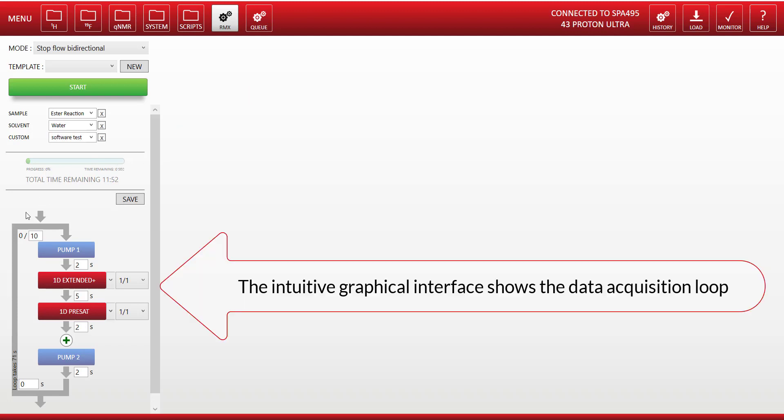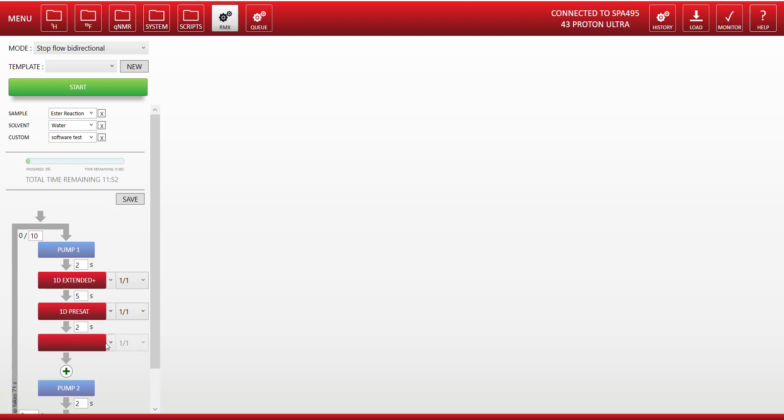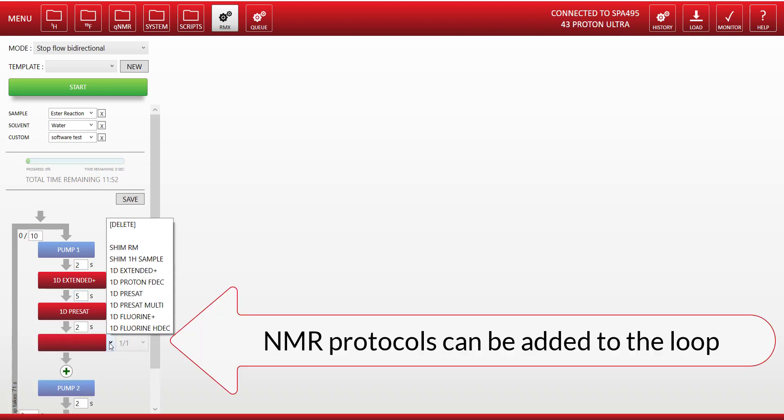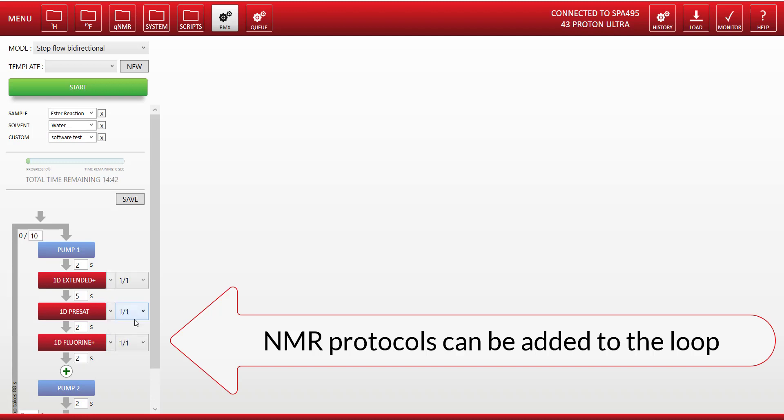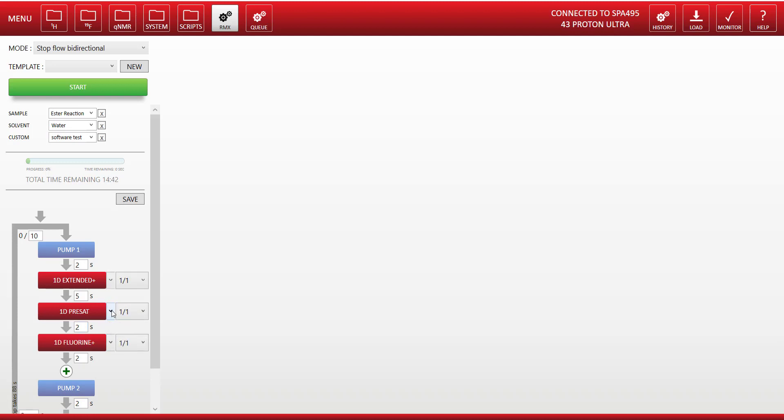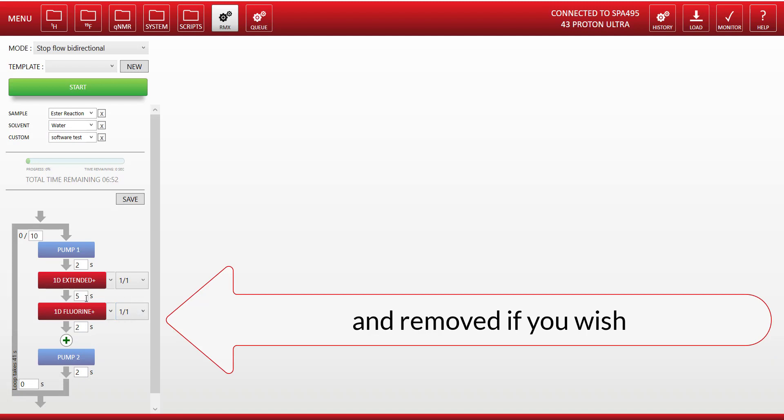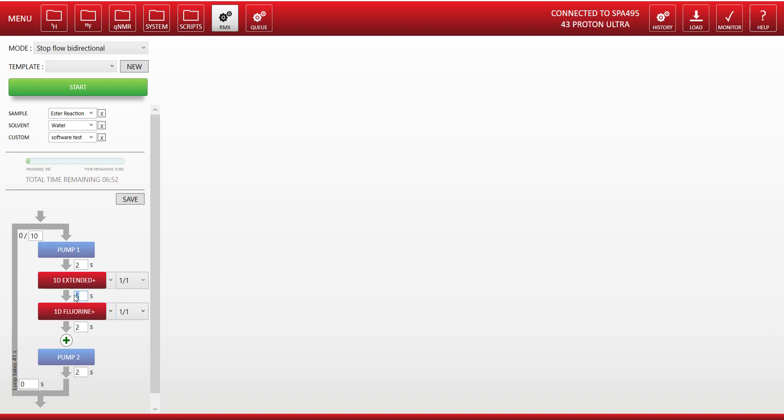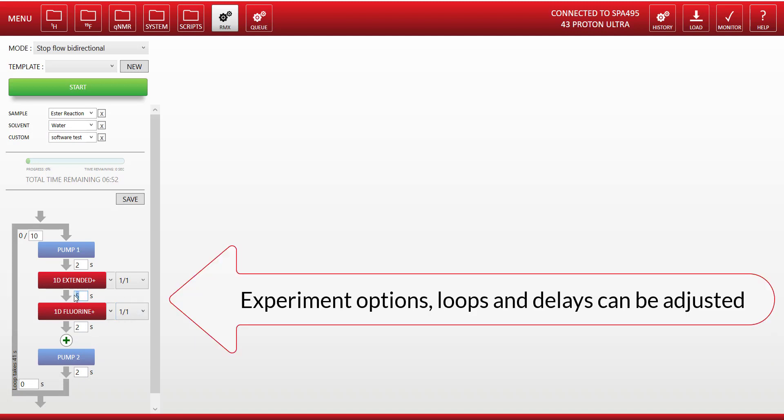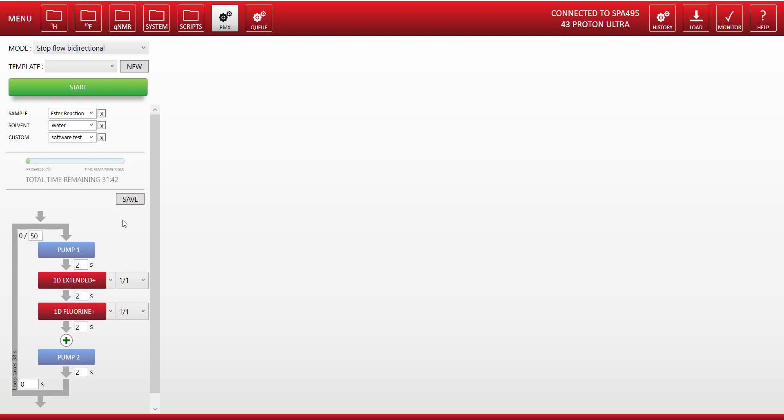In the bottom of the left-hand part of the screen is the reaction monitoring loop. This is the loop where the protocols are run. We can add a new protocol like a fluorine, we can remove a protocol that we don't want to run, and we can adjust parameters such as the time between the protocols and the number of times we want to go around in the loop.